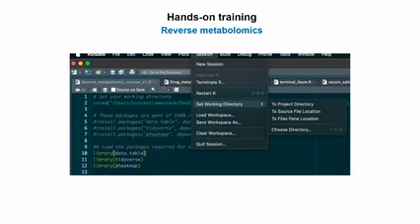Yes, for most of you? Good. So here you just have to choose the directory, with all the files that you downloaded, right? So we went too fast. You queried, let's say, phenylalanine and cholic acid, those 3 same molecules. You generated the 3 CSV files, and they should be in your download folder. What you can do is just drag and drop those into your desktop, right? And then you can just have a folder.